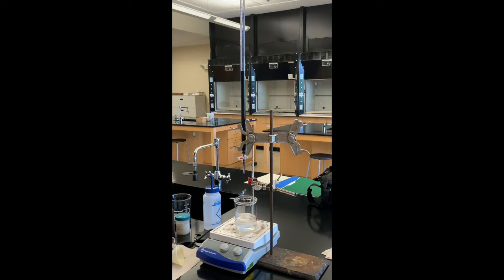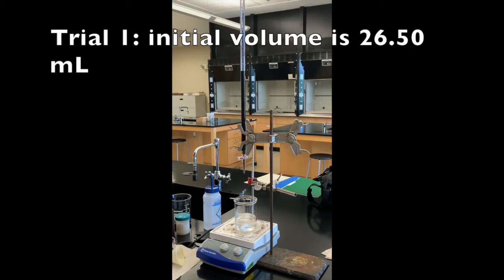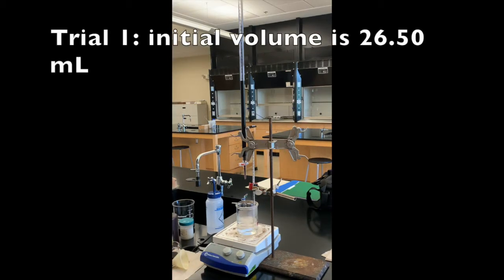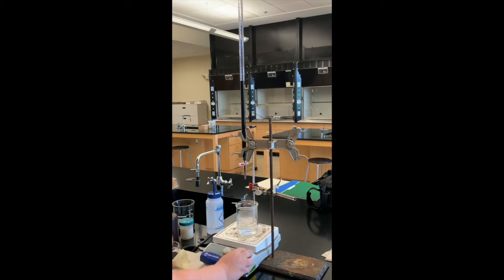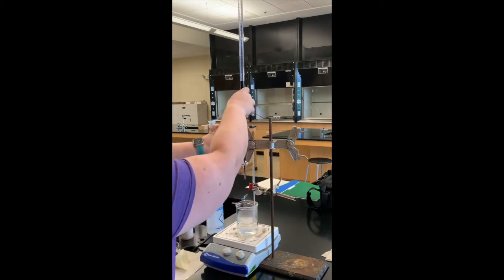I'm going to still heat this one up to about 60 degrees before I start titrating. So our initial volume for trial one on Part C will be 26.50. Our initial volume is 26.5 milliliters. Our solution is about at 60 degrees, so it's ready to start titrating.